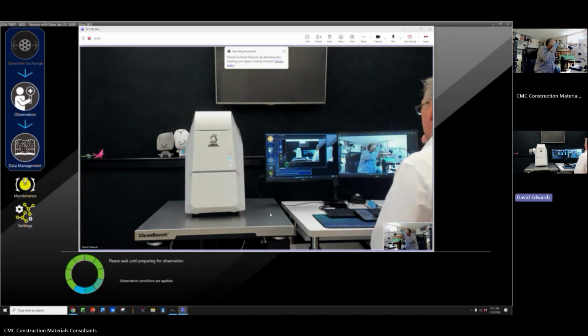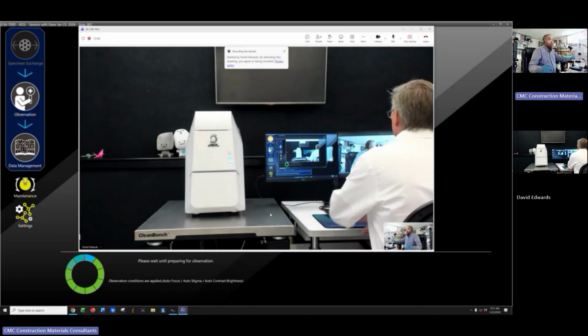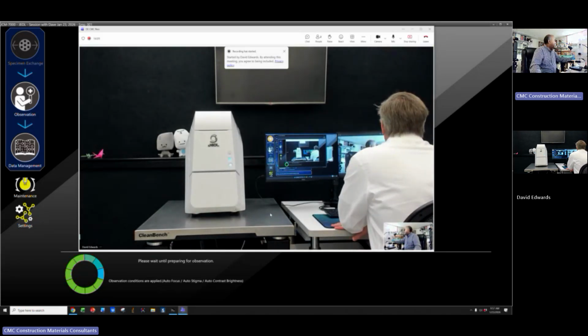Go ahead. So first I'm doing this now. So right now I am ready. So I can turn off the SEM. Let me see.